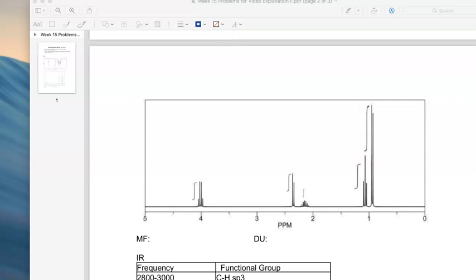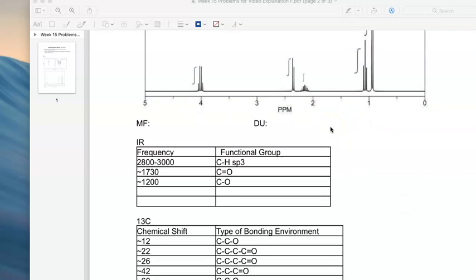So when labeling, we would label this as 6H, standing for 6 hydrogens. And then we can continue to go through the rest, labeling based off of their locations on the molecule.